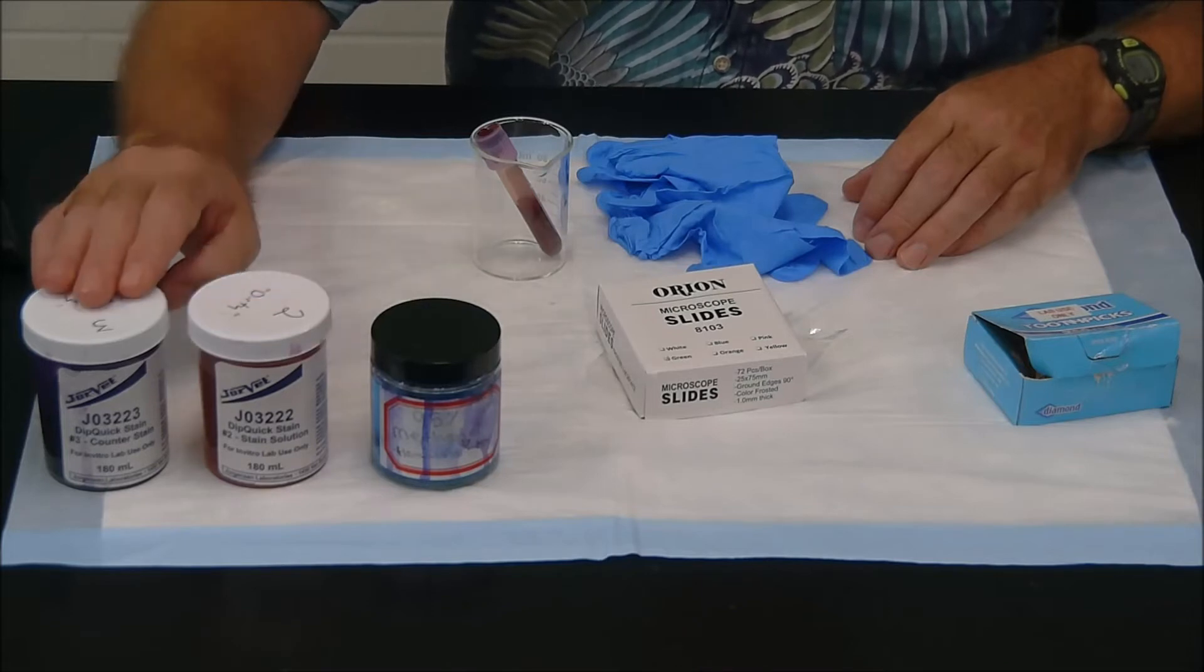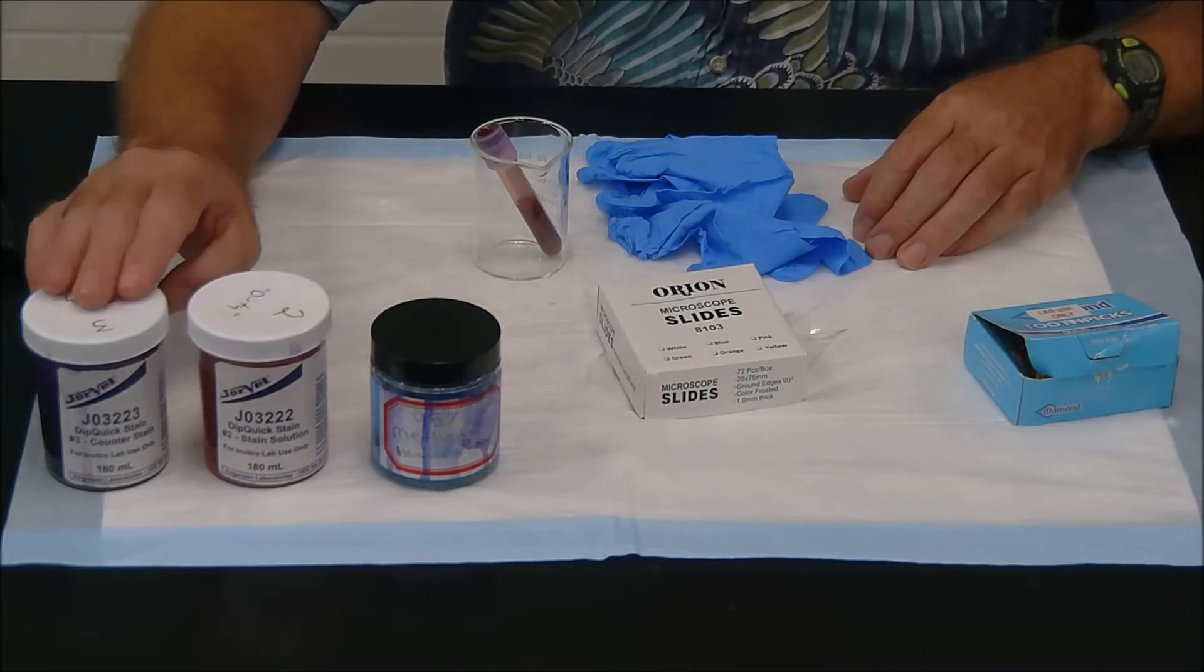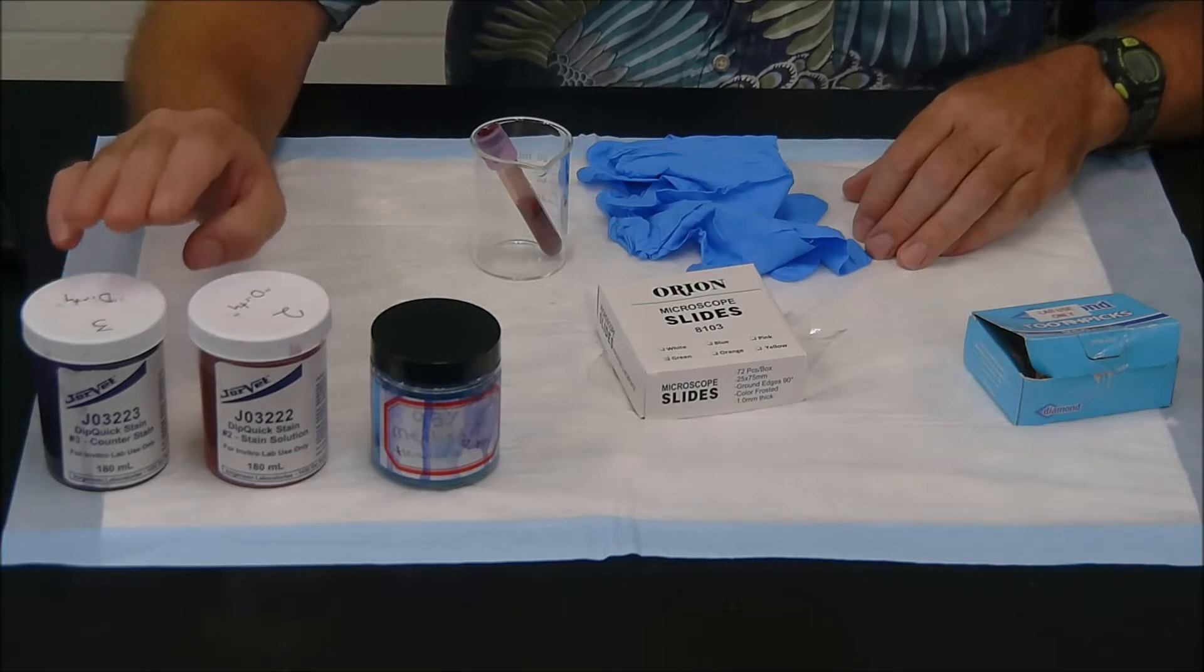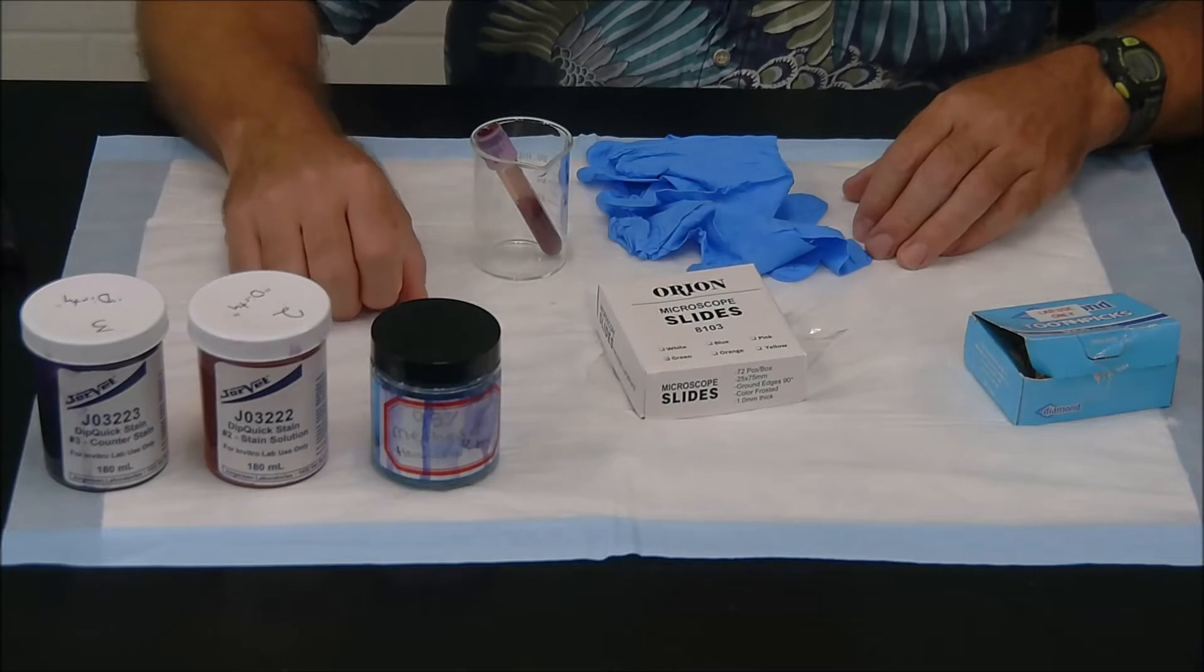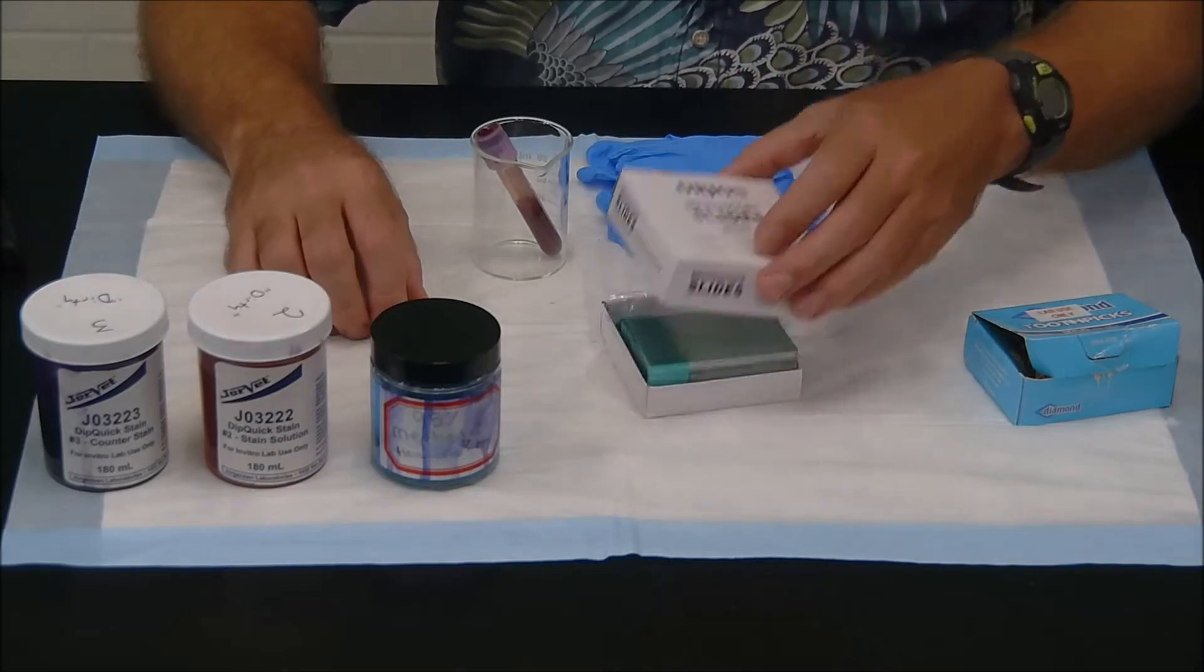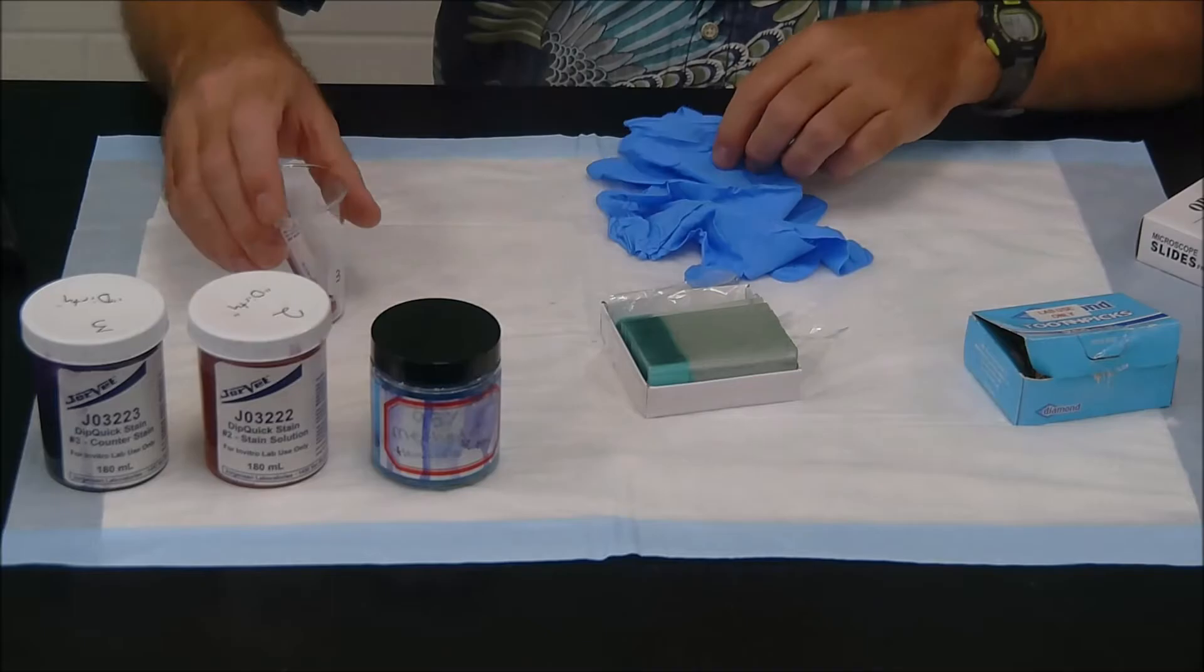And then finally, the third thing here, this stain is probably methylene blue or something like that. And that's going to be primarily a nuclear stain. So we're going to fix, stain, stain. But before we can do that, we actually have to prepare our blood smear using some microscope slides. So let's go through that process.